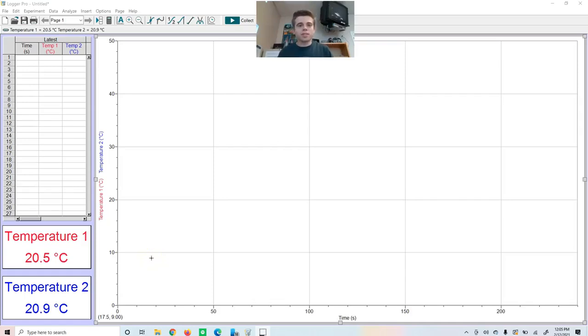Hey Chem Kids, Mr. C here, and today we're going to do an experiment based on intermolecular forces. Specifically, we're going to be looking at evaporation and how evaporation tells us a little bit about the relative strength of intermolecular forces.